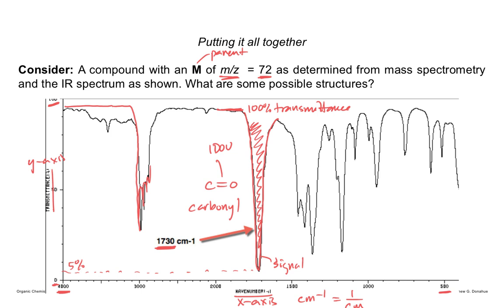Any questions so far? So we're going to return to this spectrum probably on Wednesday. But right now what we're going to go through is how to think about functional groups and where they lie on the x-axis.